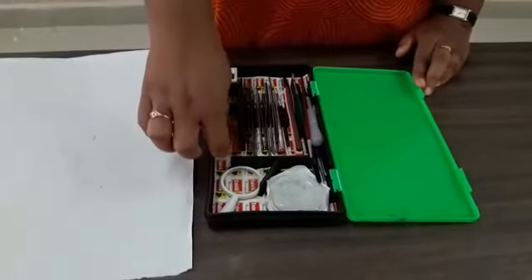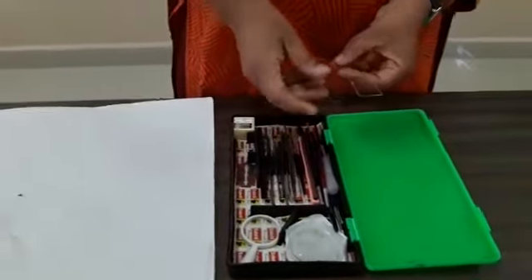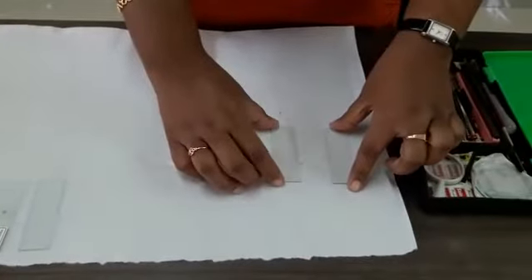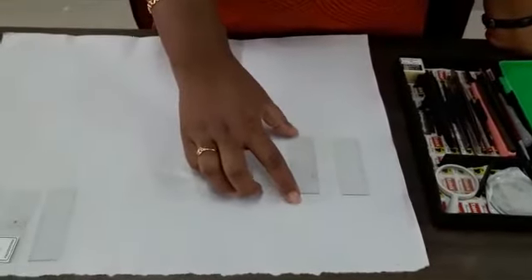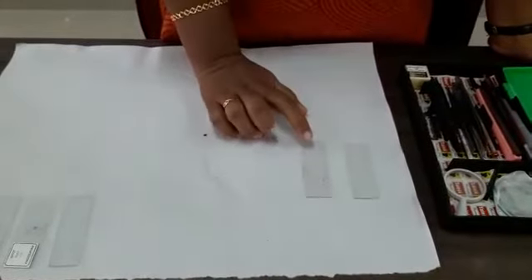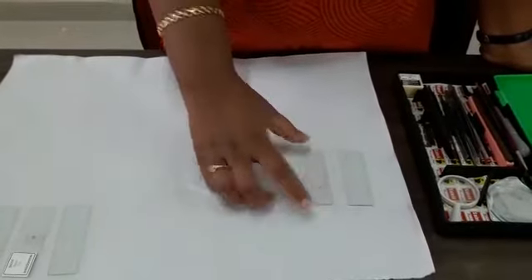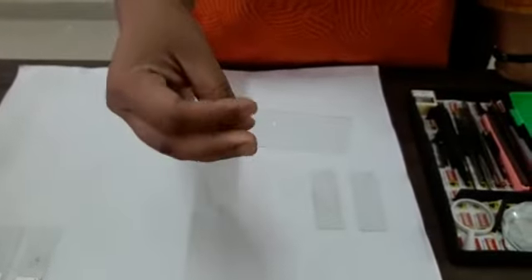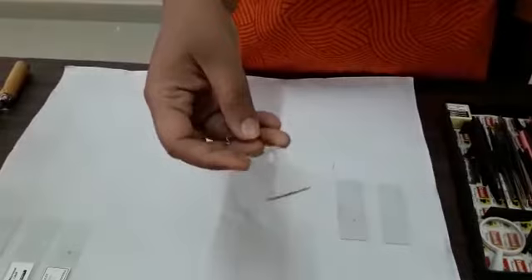Starting with glass — this is the glass slide. I have two glass slides in this dissection box; these are plain glass slides. There should be at least two to three slides. Usually when you purchase the dissection box there will be only one glass slide, so you have to purchase at least three separately. I have kept one more type of glass slide which has a cavity in the center — we use that for second year practicals. For first year practicals, we need plain slides.